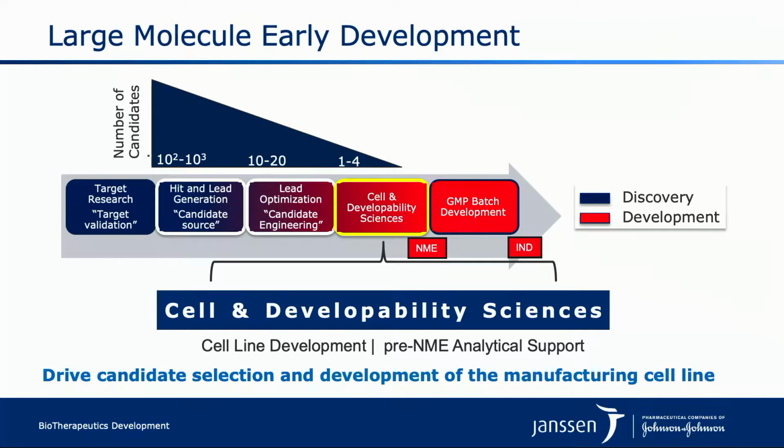an analytical support group, doing a series of biophysical as well as mass spectrometry analytical assays on those cell lines as well as the product generated from the cell line to ensure the cell line has the best quality.